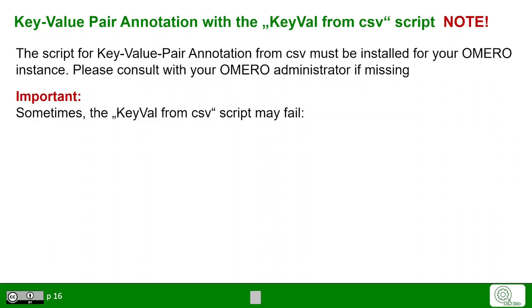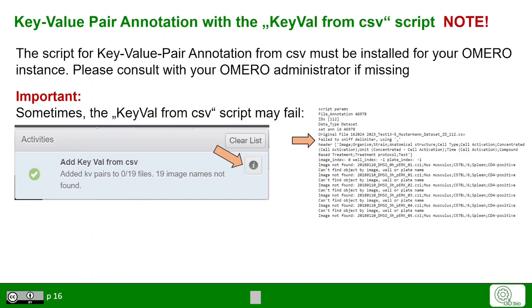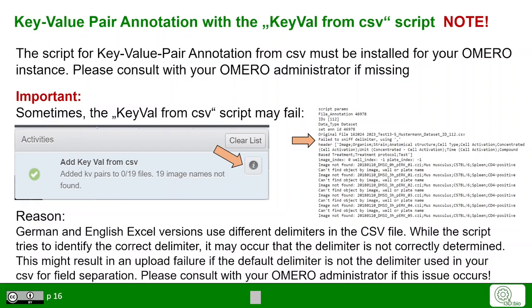Here we highlight a potential issue that sometimes arises: in some cases, the key-value pair script fails because the script must identify the correct delimiter — this is called delimiter sniffing. If the delimiter is not correctly identified, the script just chooses one. Note that German and English Excel versions can use different delimiters in CSV format, so the script may not correctly determine it, resulting in failure to assign key-value pairs. While this problem is being worked on, if it occurs, consult your OMERO administrator.